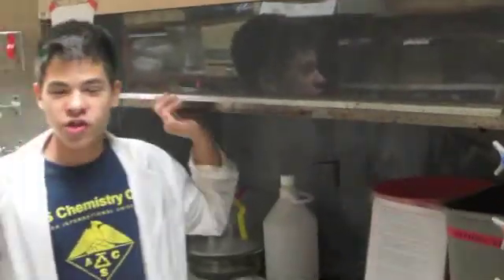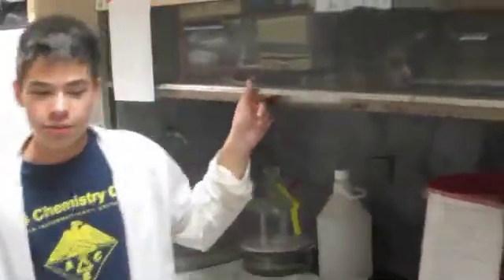Over here we have our fume hood. Now the primary use of the fume hood right now is just for making acid wash. Now acid wash is very important in this lab to ensure that all our glassware is clean and free of contaminants, because the contaminants could really affect the measurements taken.